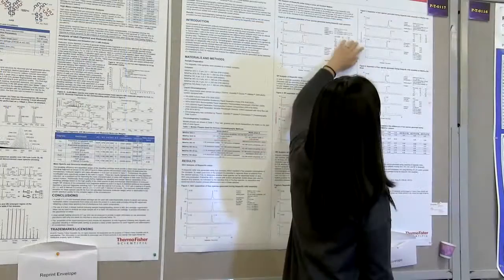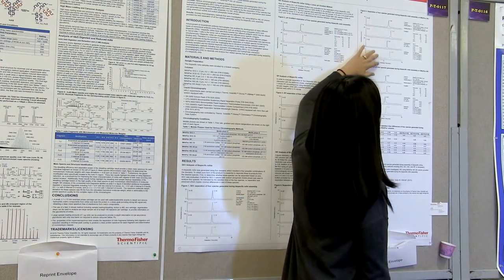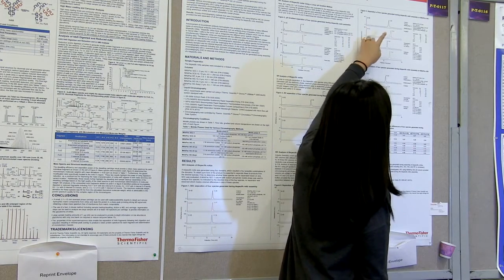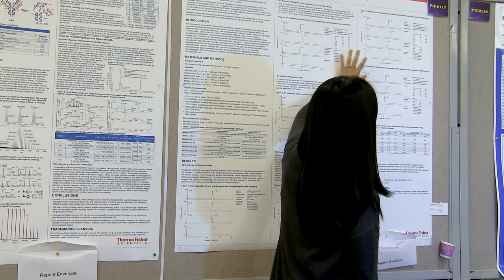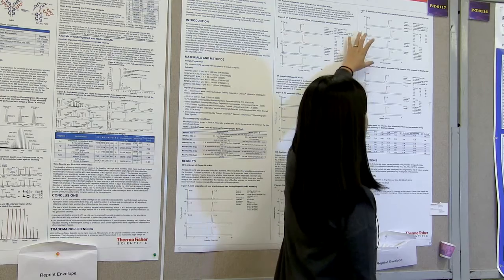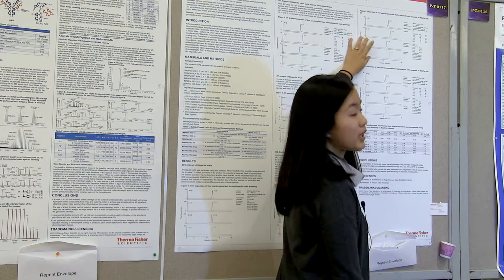With this column, we were able to actually separate all of the four species. So you can see the retention times here labeled, and you can see that they're all separated. So the winner of all the study we found to be the mAbPac HIC-20 column.